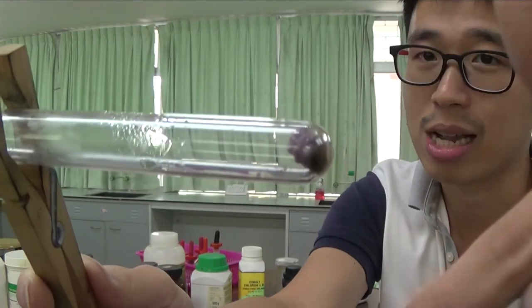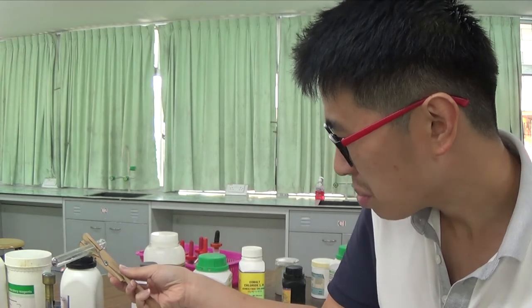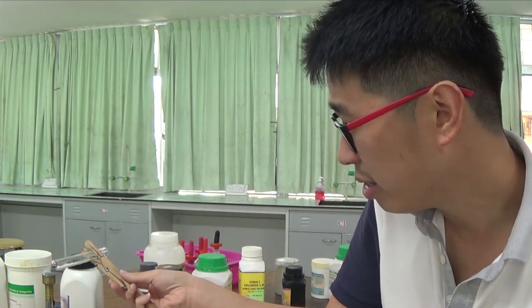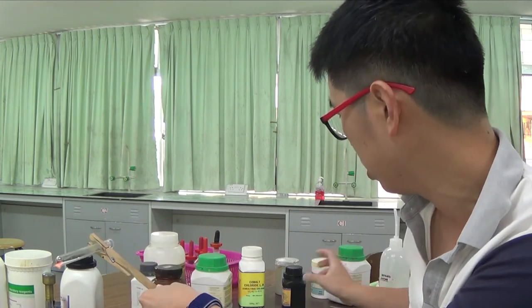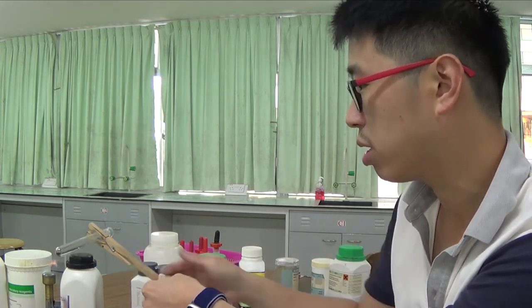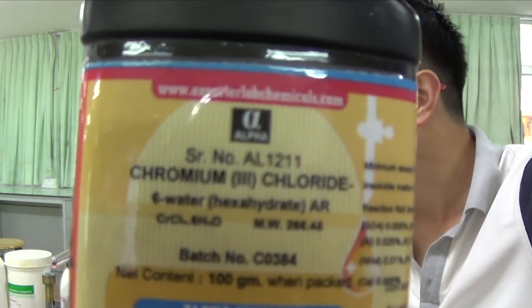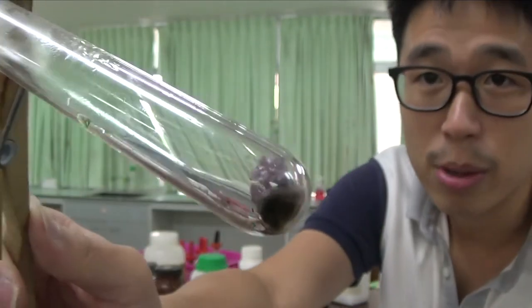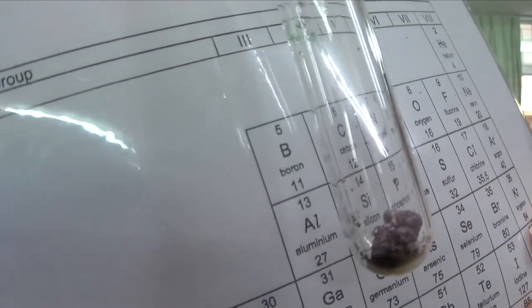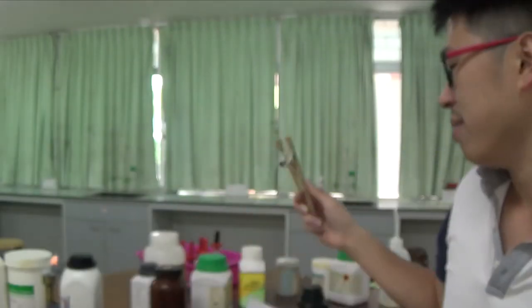And then because we started with a colored compound, which was green, if I heat it a bit stronger, the color is actually no longer green. This was chromium, what's this again? This was chromium 3 chloride. Hexahydrate. Okay, so it looks like it's just the water on the upper part there, and then what happened to the solid itself? It's gone a bit purple-ish, a bit purple, a bit dark purple. Quite hard to see. Yeah.